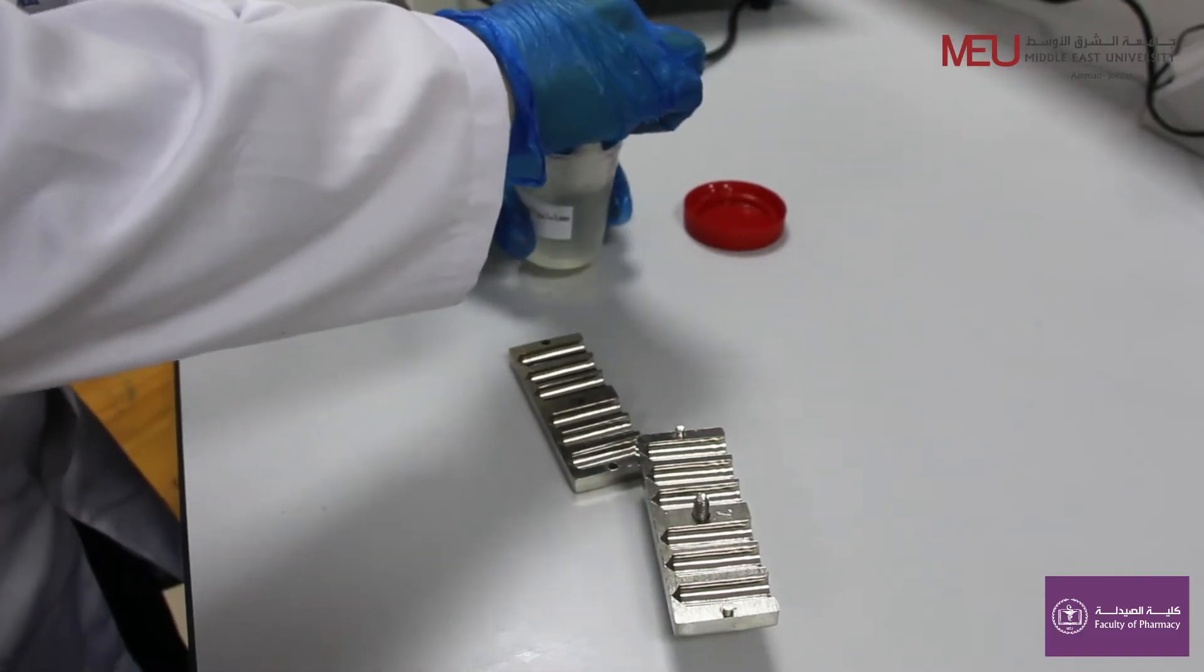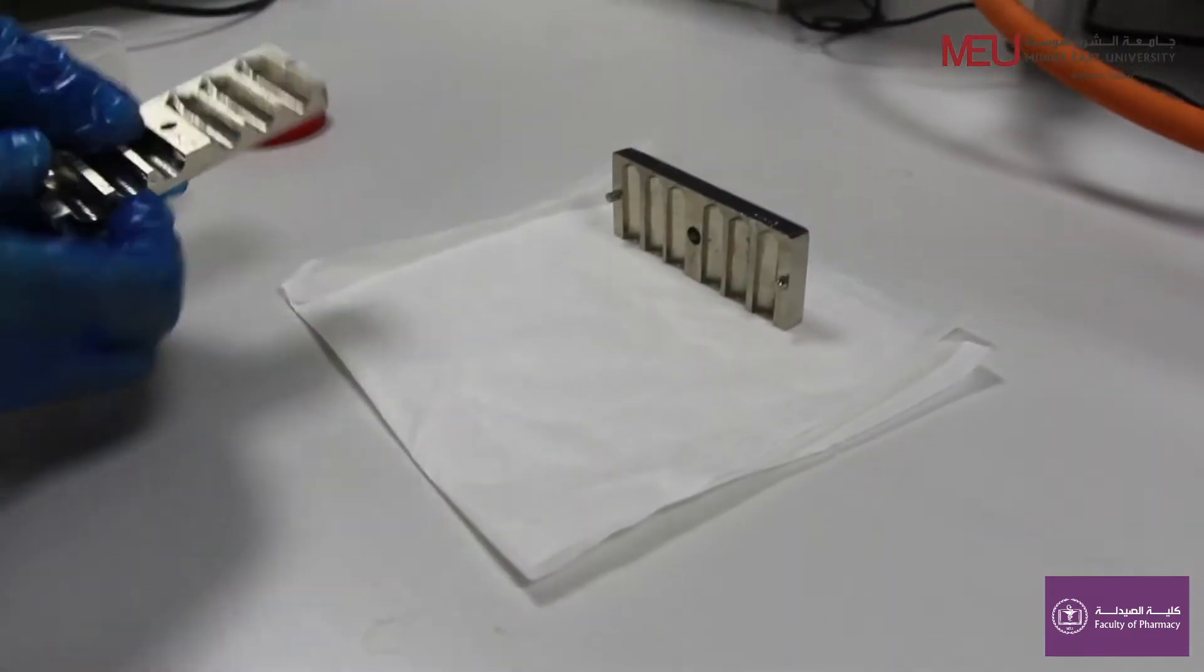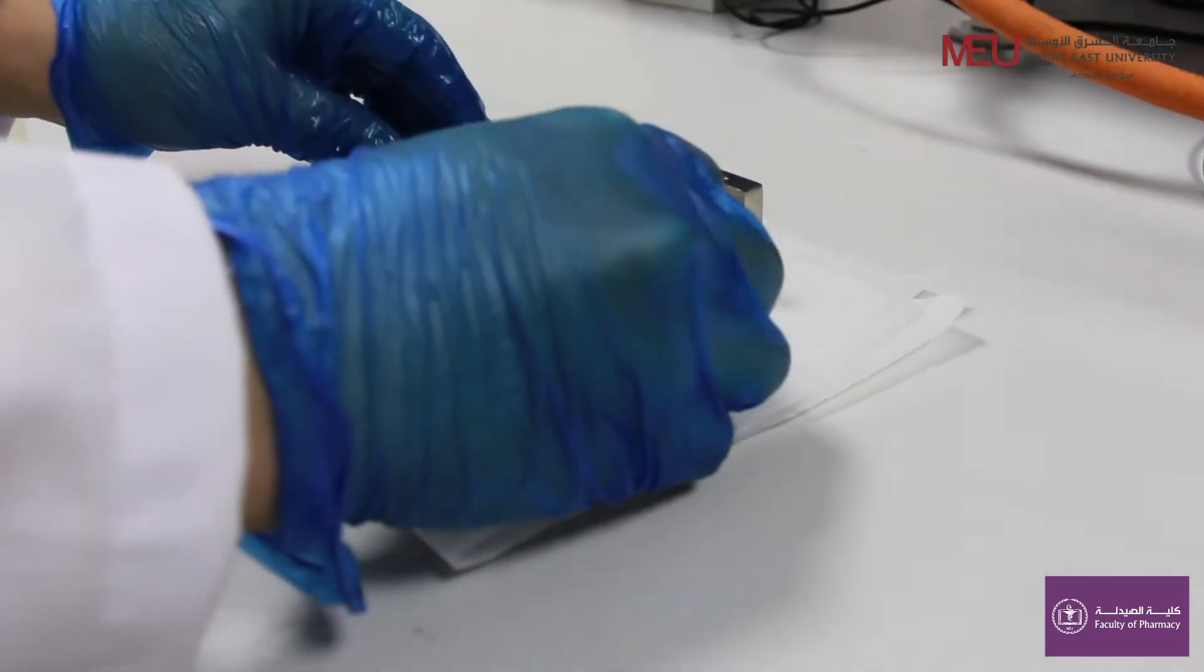Lubricate the mold with the soap solution. Invert it to allow any excess lubricant to drain off.